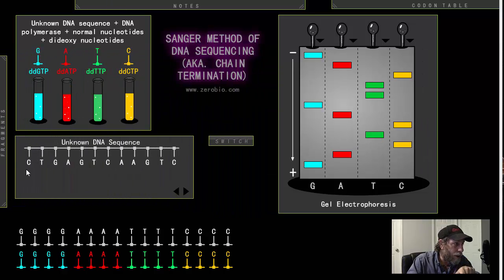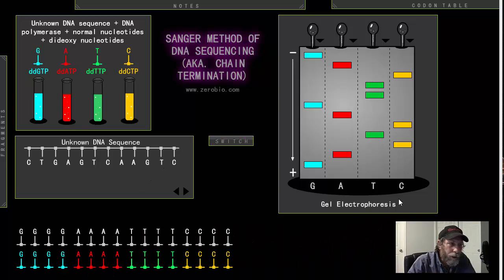Okay, let me clear that. This, right? That G, A, whatever, we're not actually seeing it here. So we have to take the complement. In order to get the actual DNA sequence, just take the complement of this stuff. So if this is G, A, C, T, C, A, G, T, T, C, A, G, right? That's what we had before. We need to take the complement of that to get the original DNA sequence.